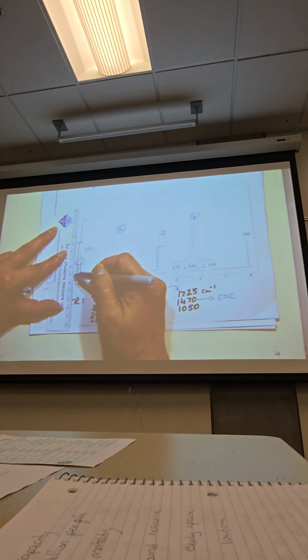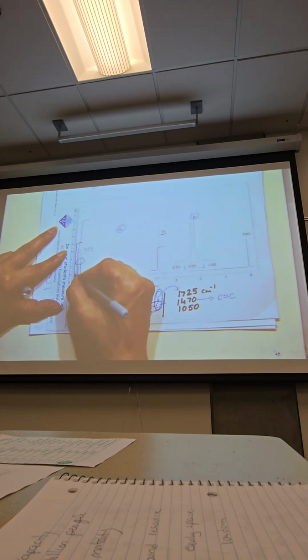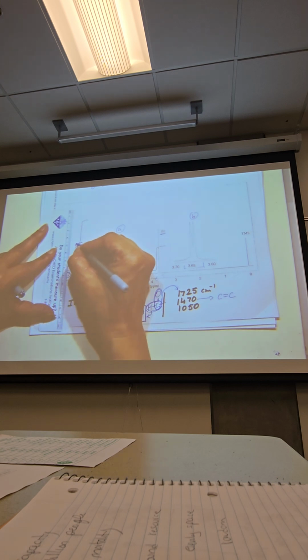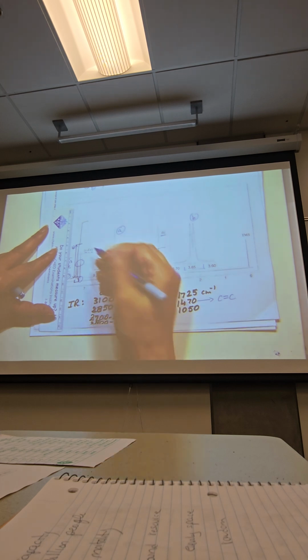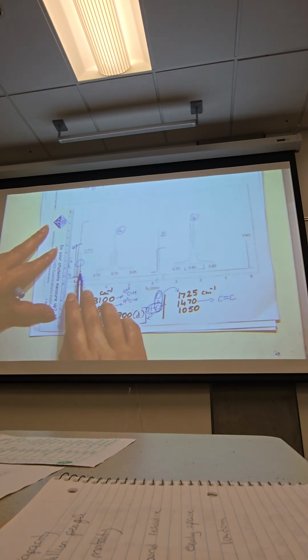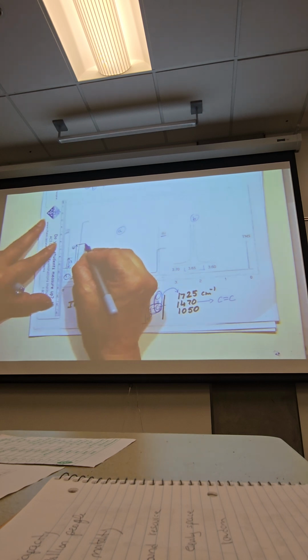So let's see. 1, 2, 3, 4, about 41, 42, something like that. Let's again keep that always with a little bit of flexibility in there. And then for this signal right here, I'm going to measure from here.